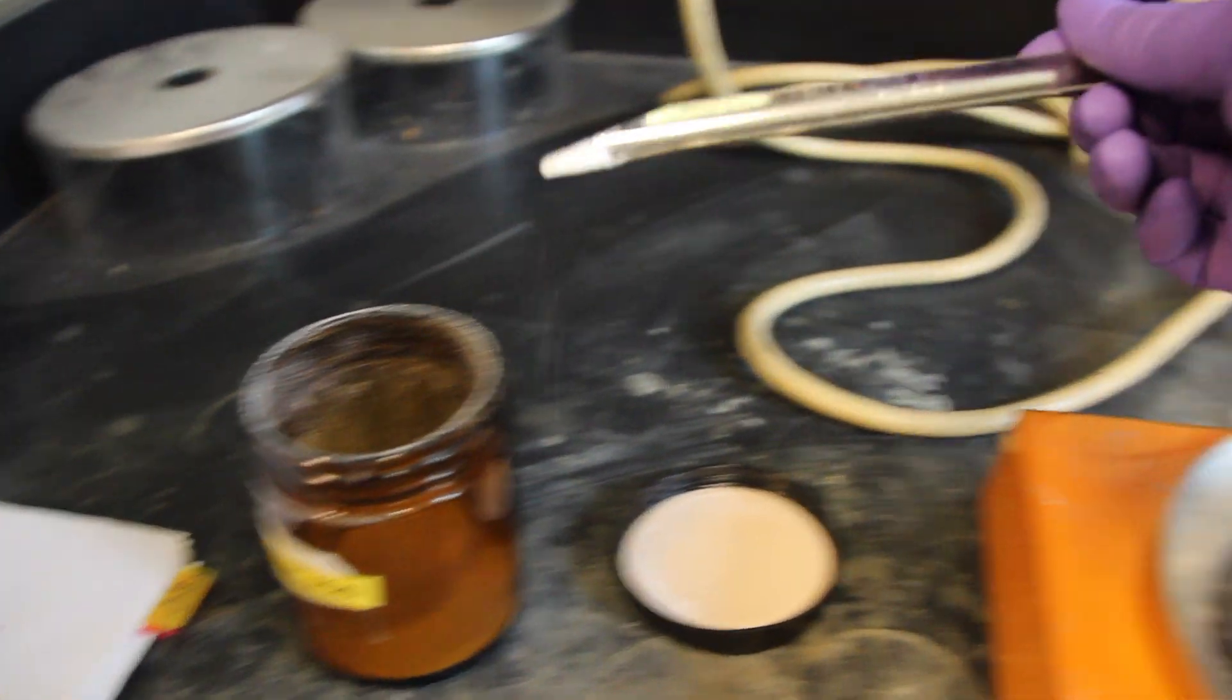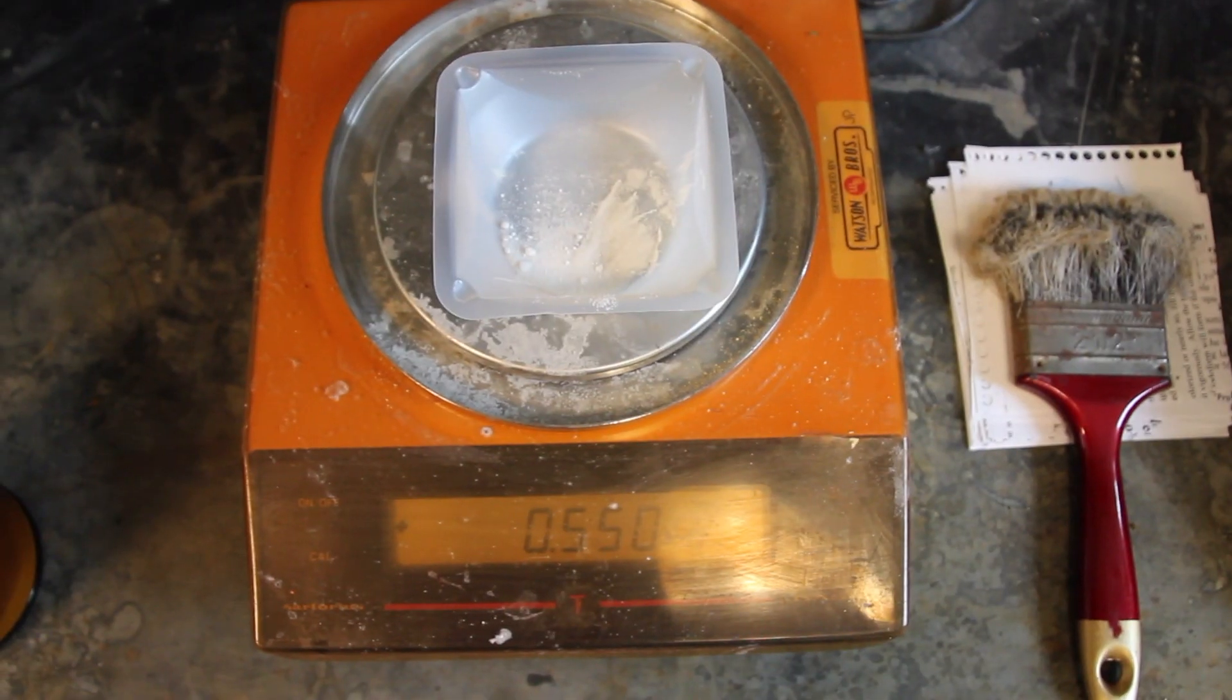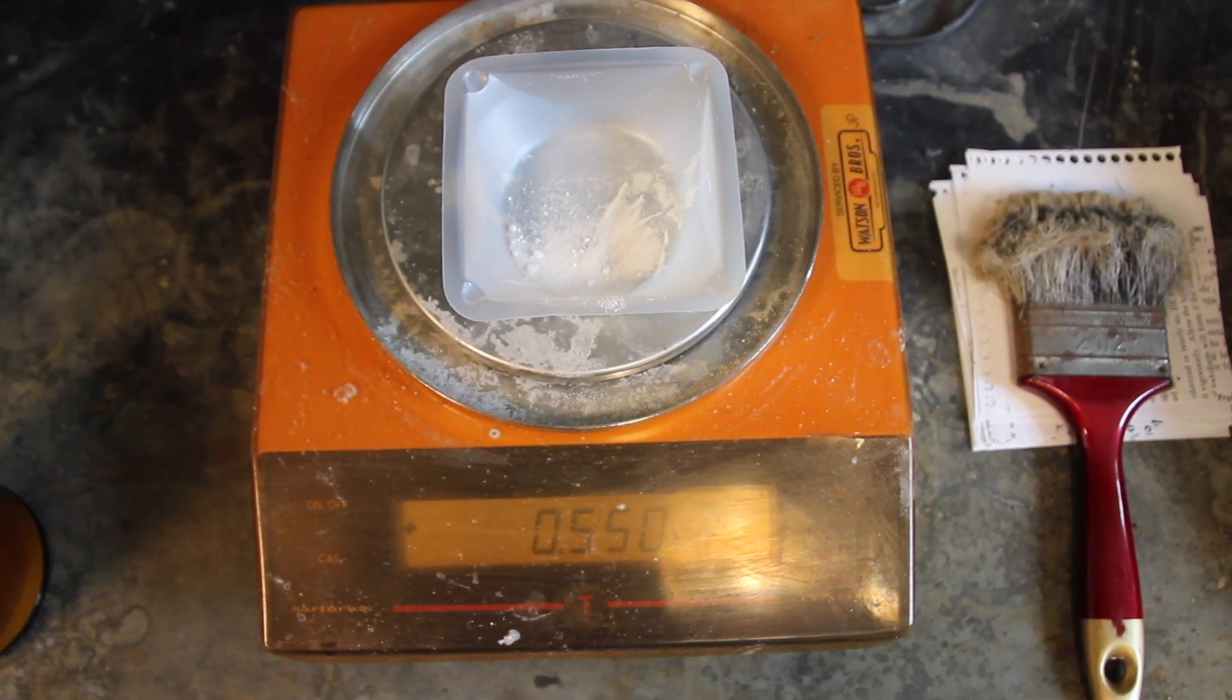To do this, measure out 0.5 grams of toluic acid into a 25 milliliter Erlenmeyer flask.